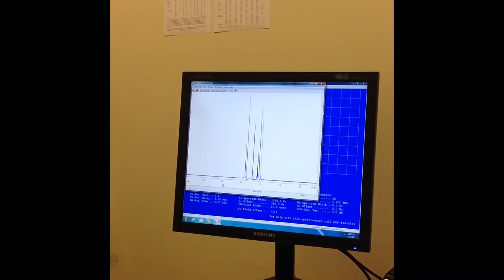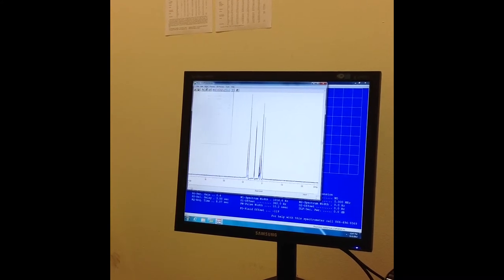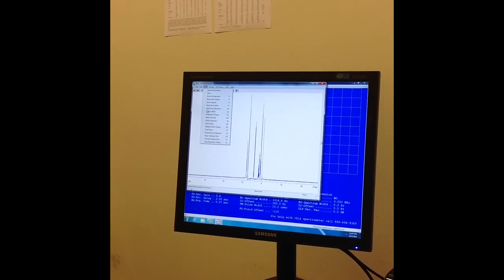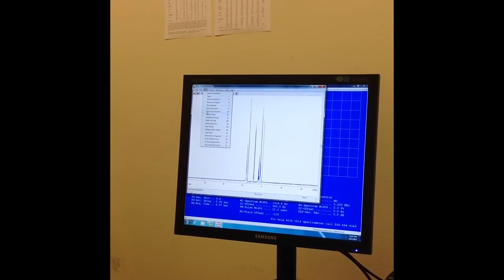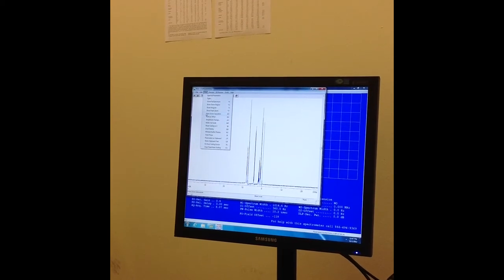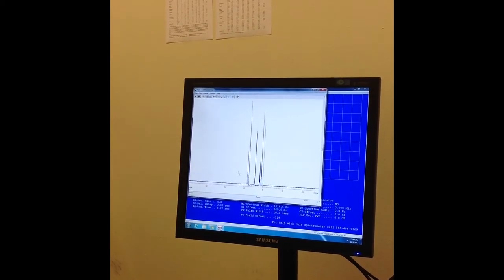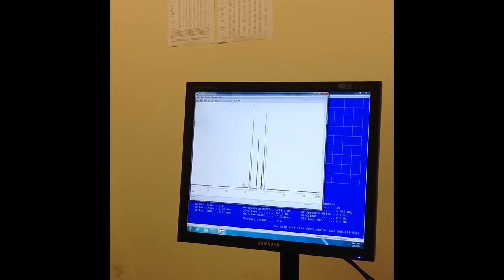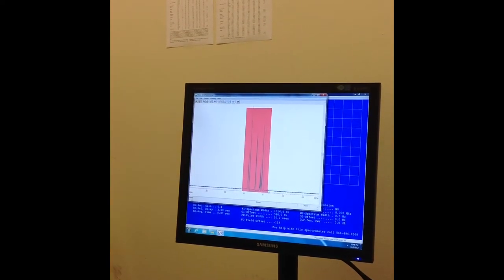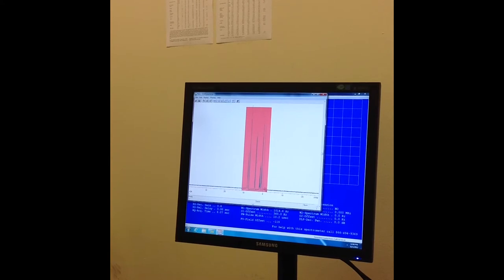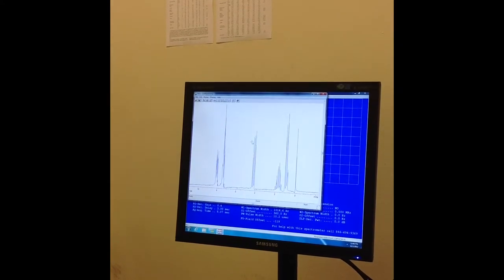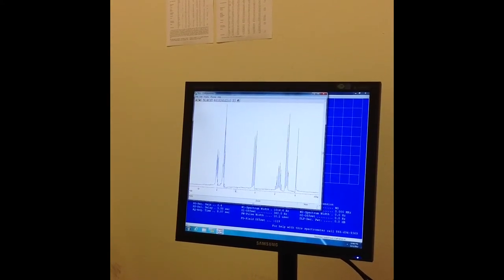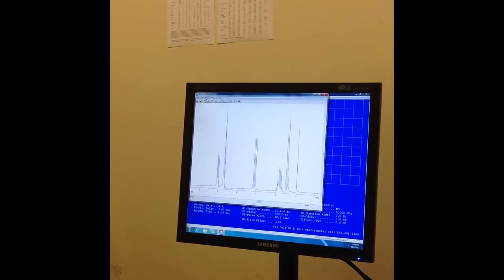The first thing I'm going to do is go under view, and I'm going to start the zoom operation. I go under this tab, view, and then I click on ZO. Then what I do is I take the left mouse button, and I drag it over the entire spectra with the left mouse button, and then I right click it. As you can see, it zooms in on our spectra.